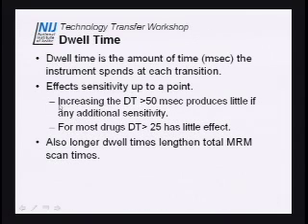All right. So, any questions about selection of a transition ion to put in your MRM method? Any questions? You chose 128 because it was unique and then optimized. That's sort of what we're saying. Right. We actually did dextromethorphan on the first instrument we had, and 272 to 128 was the one that worked fine. It's the one that worked the best, and it was very specific for dextromethorphan. We did the infusions on other instruments, and sometimes 171 would be a little taller, and sometimes 128.